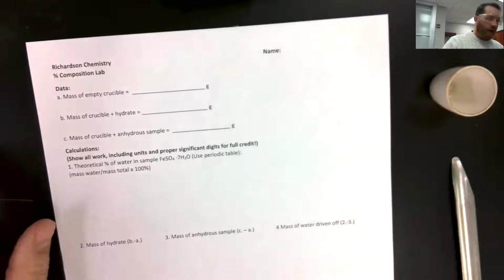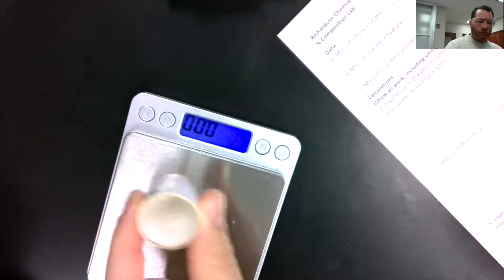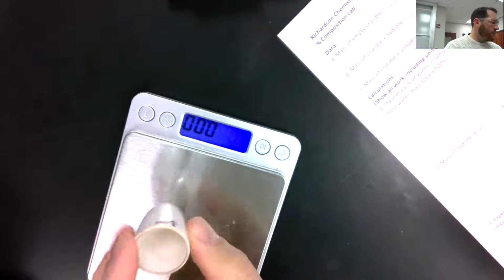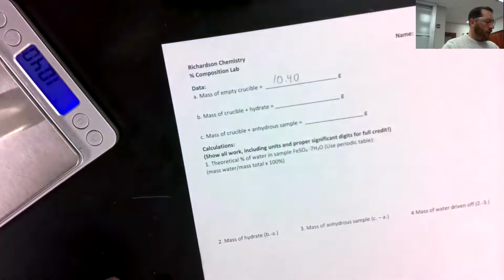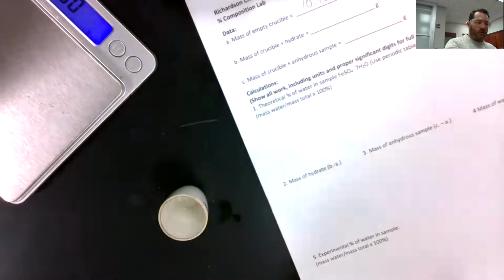And the first thing we have to do, balance. First thing we need to do is find the mass of our empty dry crucible. So this is a crucible, just a little ceramic cup that we usually use to heat things. All right, so there we go. 10.40 grams. Now next up, I'm going to put a little bit of salt into the crucible.